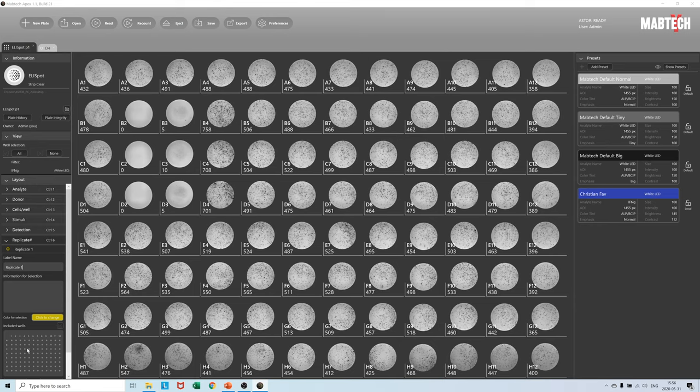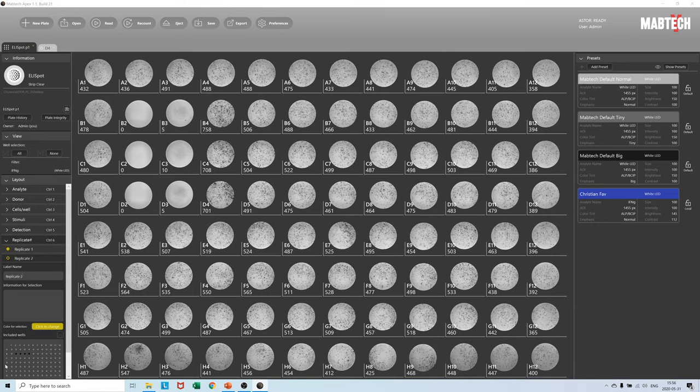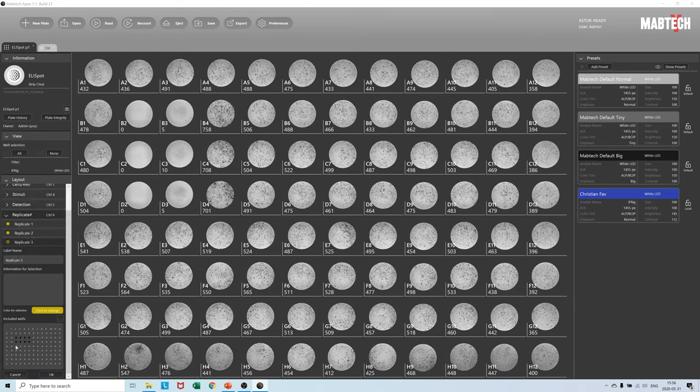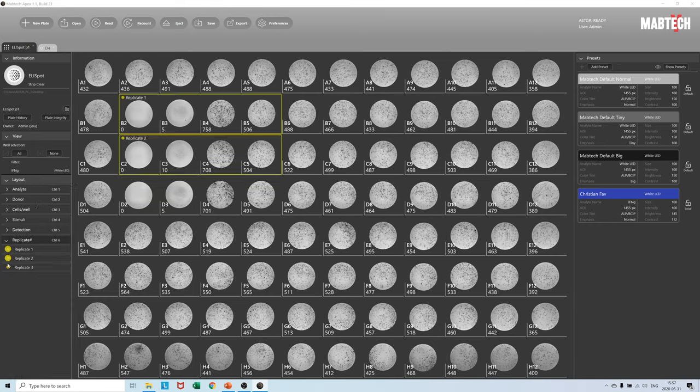Finally, the replicate numbers are added as seen in the video. Absolutely crucial for pivot table functionality.